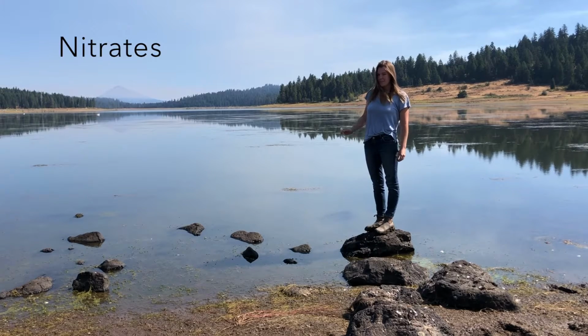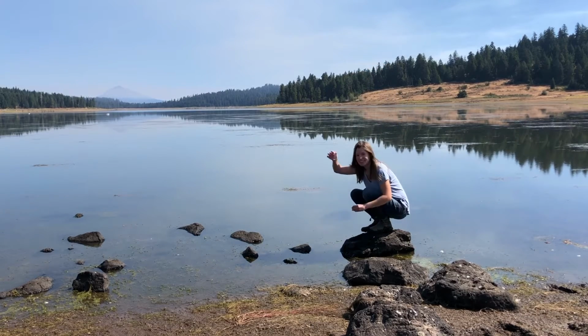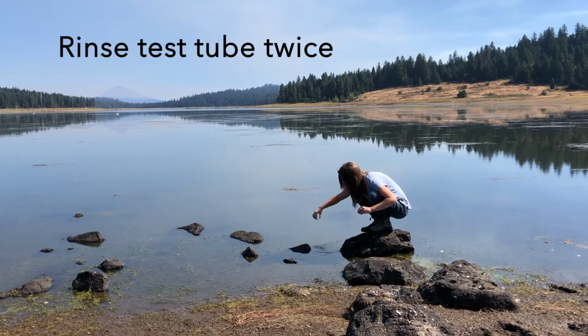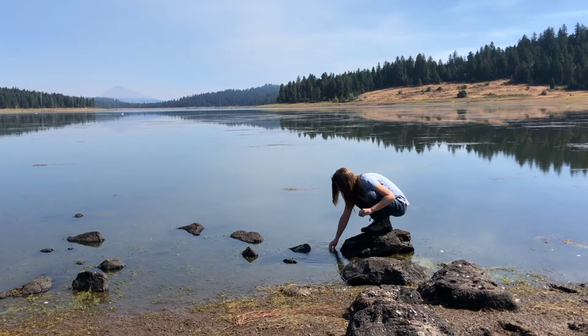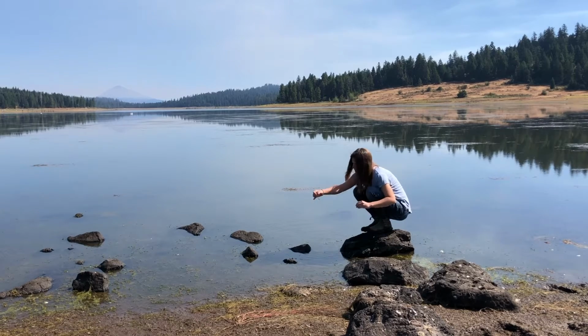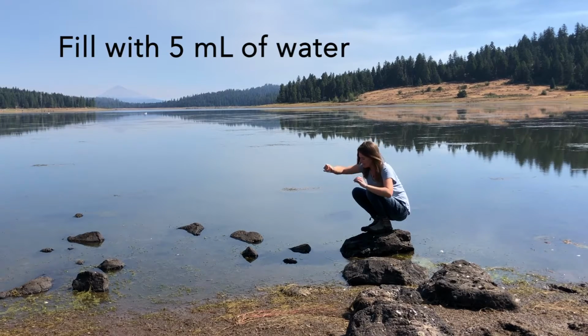We're collecting a sample for our nitrate test right now. So first it says to rinse this container out 2 times. And then the directions say to fill to the bottom line right there. That will be 5 milliliters.